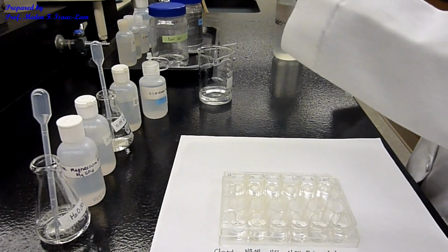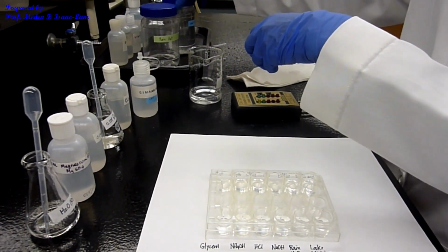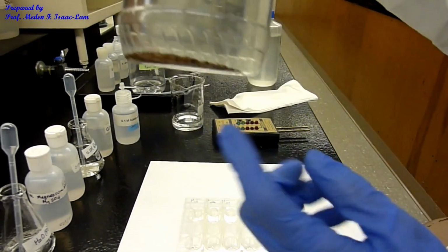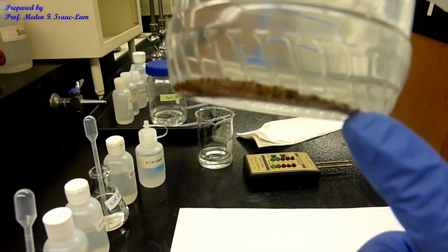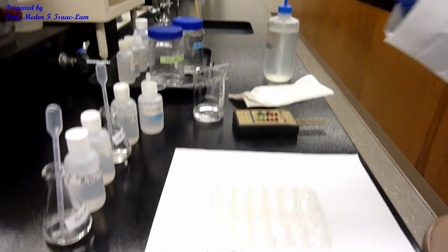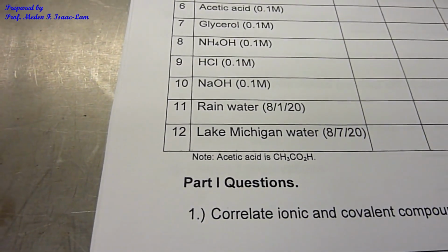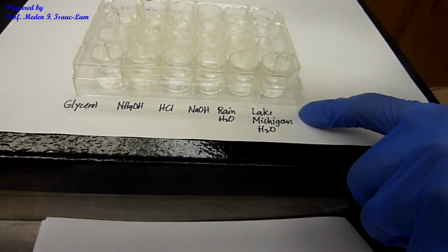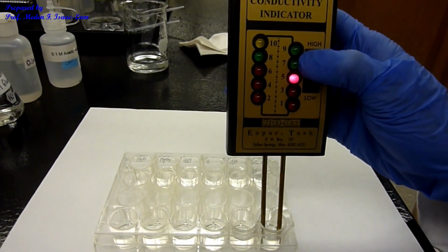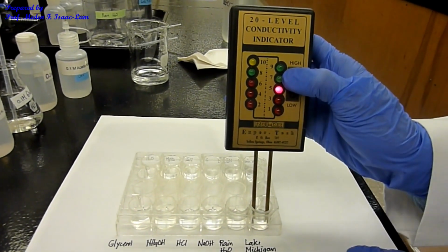Last sample is Lake Michigan water. So as you can see, there's actually still sand at the bottom, right? So Lake Michigan water, last row. Okay. Now, the last well in here, I press high. Oh, wow. That's interesting. 5.